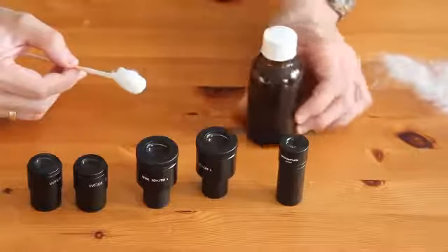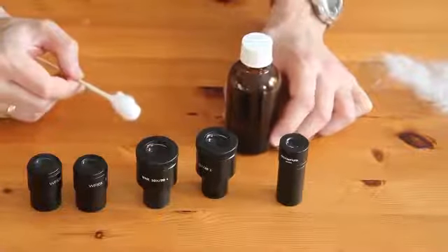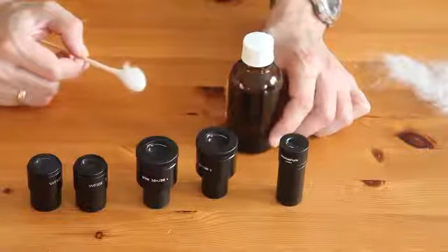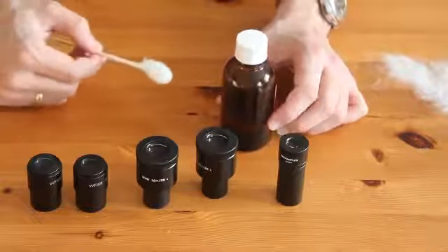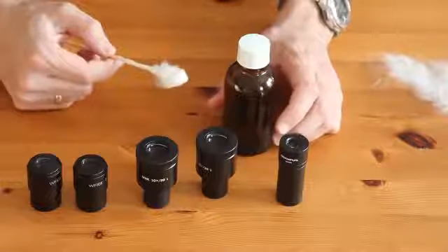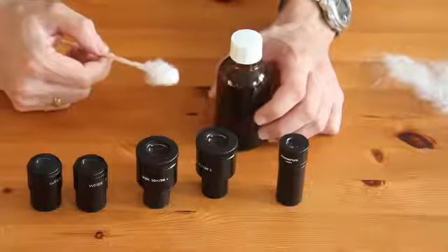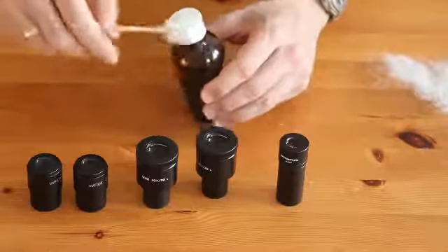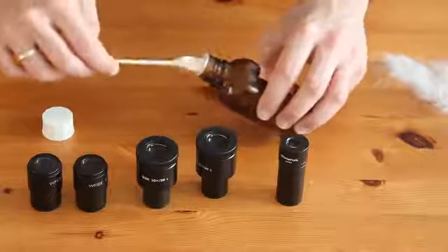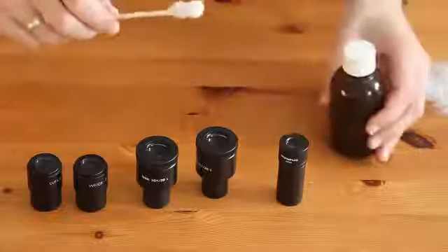You also need some cleaning fluid — you've got to be really careful and follow the instructions of your manufacturer. My manufacturer recommended a 70% ethyl ether and 30% alcohol mixture. Not denatured alcohol — denatured alcohol contains additives. I bought this in a drugstore where they mix it together, and that's my cleaning fluid. Do not use any cleaning fluid sold for cleaning eyeglasses or windshields. You shouldn't do that because there is a danger of damaging the coating. Apply some cleaning fluid to the cotton swab, making sure not too much liquid is on it.